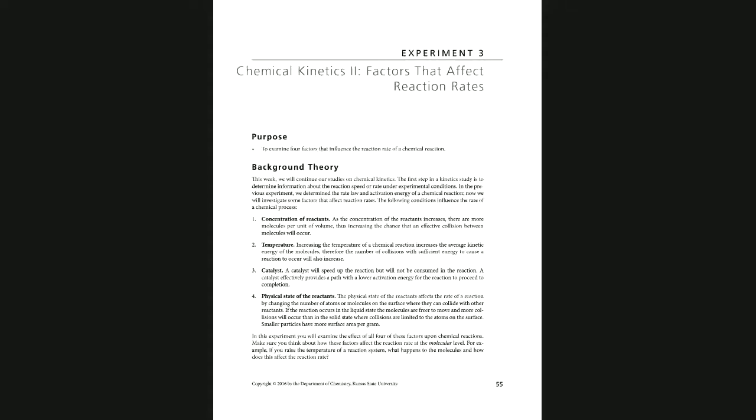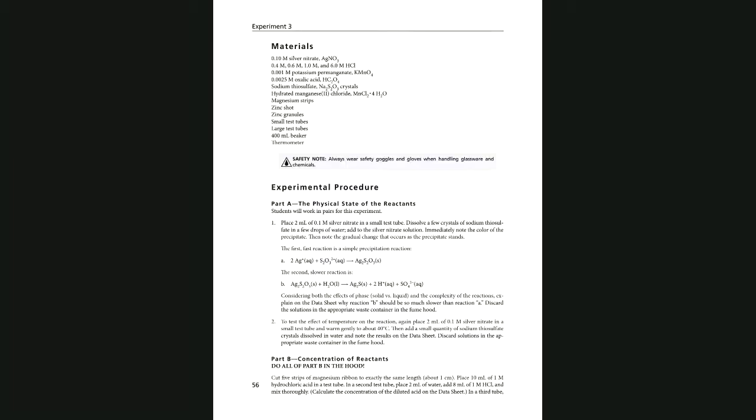The purpose of the experiment, just like other experiments, is for you to be able to record the data, and when you record the data, you are going to complete your data sheet and submit it as an assignment to your professor, me or someone else teaching the class. Now, the factors affecting the rate are going to be concentration, which is what we are going to study, temperature, catalyst, and physical state of the reaction.